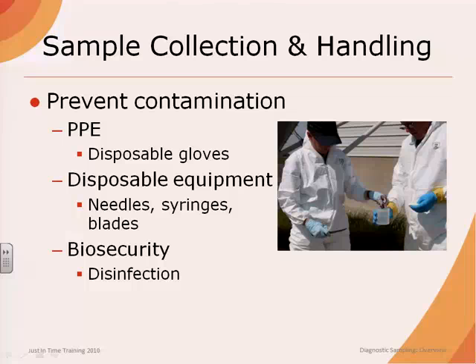When non-disposable equipment must be used, such as necropsy tools or surgical instruments, clean and disinfect equipment between each tissue and each animal. All equipment used to collect and transport samples while on the premises should be cleaned and disinfected in the designated area prior to leaving the farm. Care should be taken not to contaminate diagnostic samples with disinfectant, thereby inactivating it and providing false negative results.